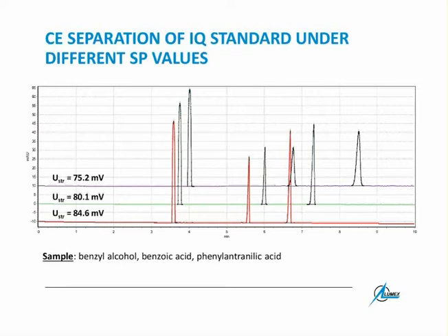And if the software measures that the streaming potential now is a bit different from what it was on the previous run, then it gives the special order to the instrument to apply additional rinsing. And thus, after this rinsing, it measures the streaming potential again, and hopefully after the additional rinsing it is the same as it was before, and then the analysis starts automatically.